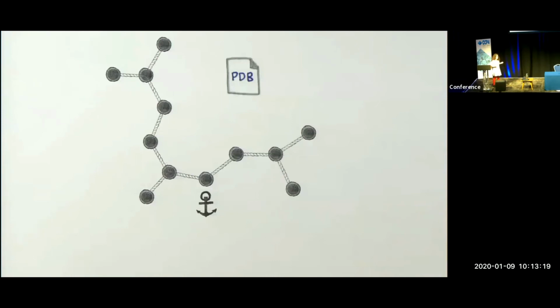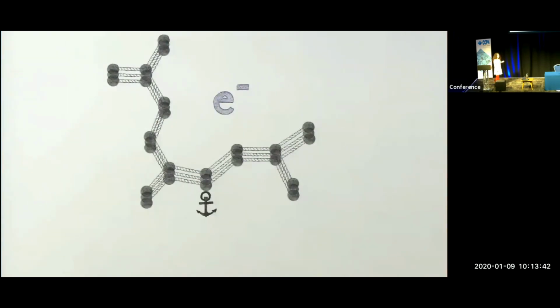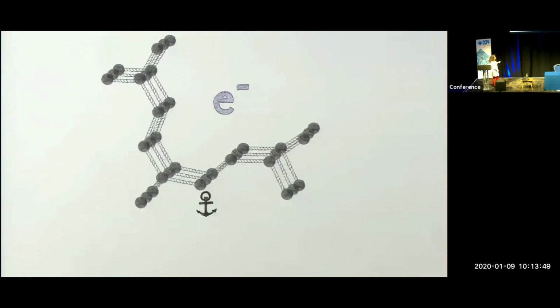And once we've done that, then we've used the initial PDB positions, and we're not going to worry about them anymore, so we can discard them, and from now on, we will just focus on fitting to the electron density. And when we fit to the electron density, we want to worry very much about the flexibility, and so we worry also about the ensemble of the proteins that we're dealing with, and we can introduce, firstly, global whole molecule rotations and translations, which are going to soak up the variability in the electron density.